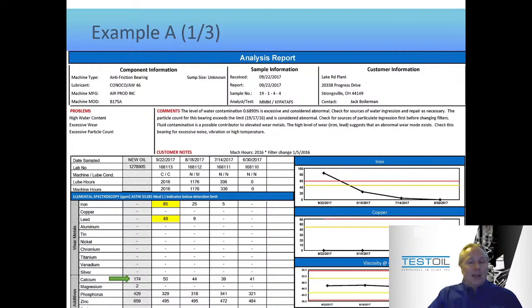And of course, that could be concerning for some people because it would mean the wrong oil was added to the machine. But given that this was a new machine, here's my thought. Is what you would call factory fill versus shop fill. The shop, the plant, the facility, wherever this is located, does use Conoco AW46. But I'm wagering whatever was put into this is an AW46. It just doesn't happen to be Conoco brand.